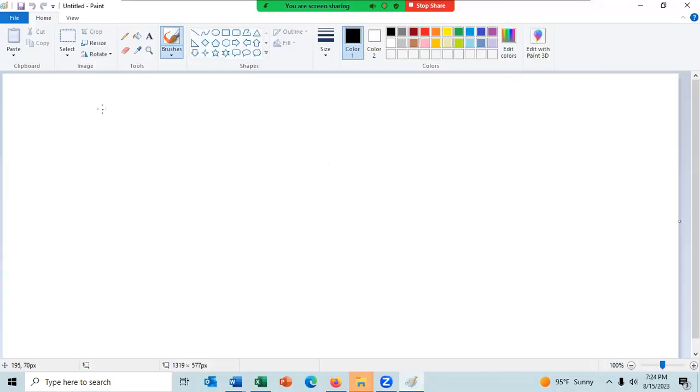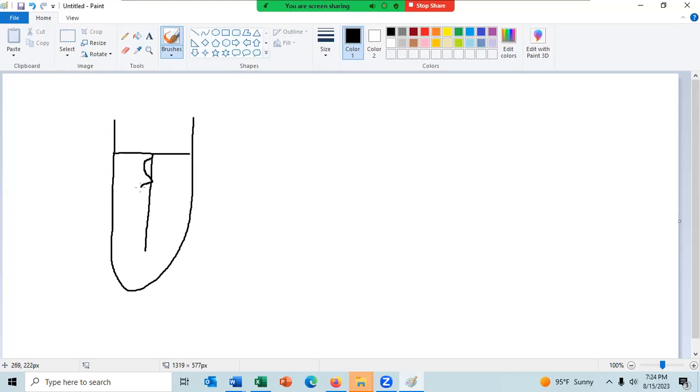Then it doesn't look like that. It looks like this. Here's our tube. There's the semi-solid agar. And then you have the stab mark. The bacteria does grow on the stab, but it flares out of the stab. And the flare usually looks something like this.